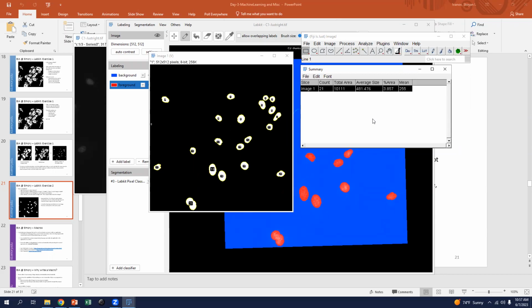If you end up using this for a long time, make sure you know how it was trained, so you know any issues that could arise, or anything it may lack because it wasn't quite trained correctly, or it was trained slightly differently than you expected. That being said, if you want to pass a classifier around the lab, make sure everyone knows how it's trained, just so they know what's inside it.